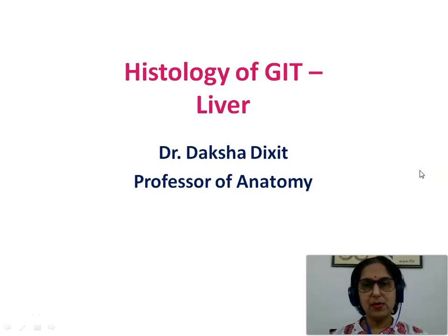Hello students, today we will be studying histology of GIT. In that we will be doing one important slide, that is of liver.